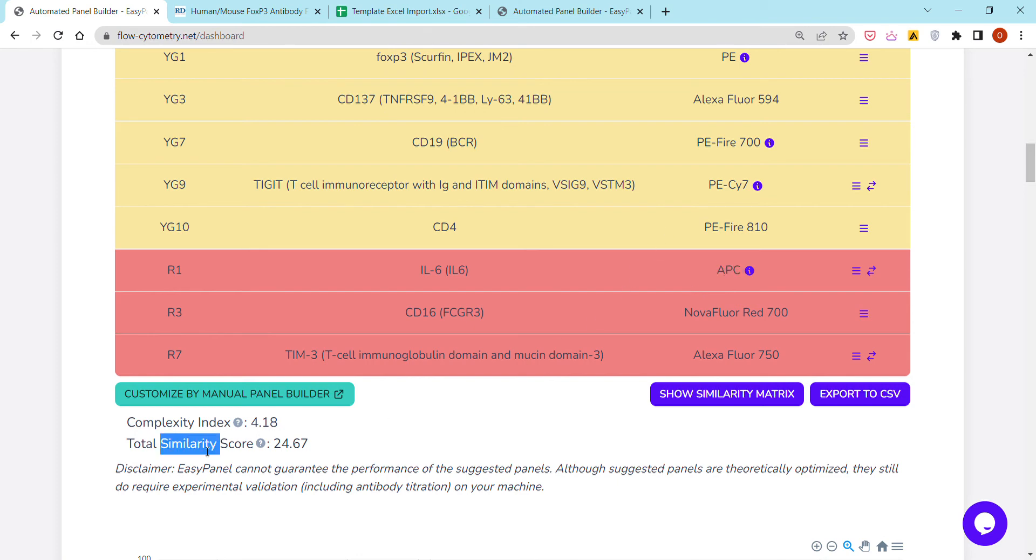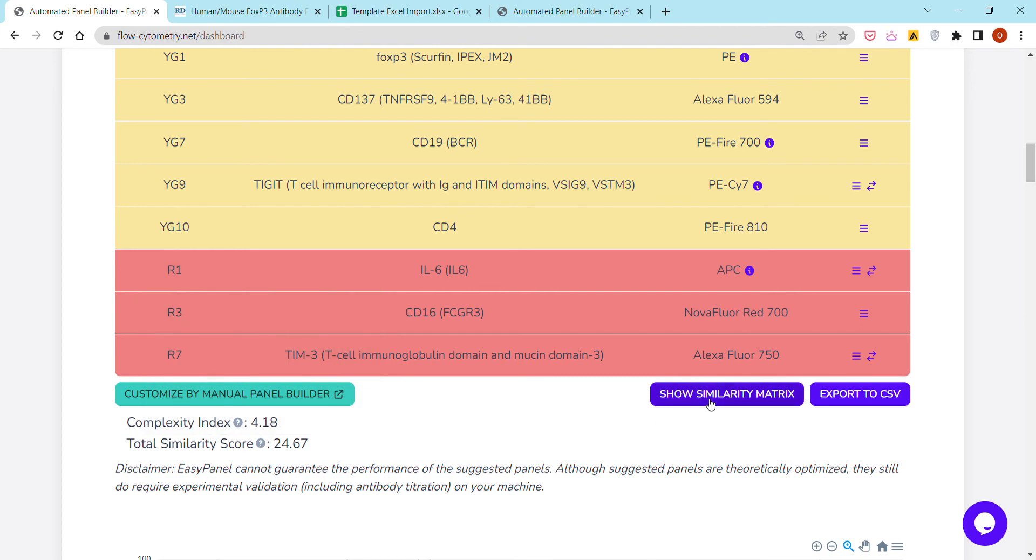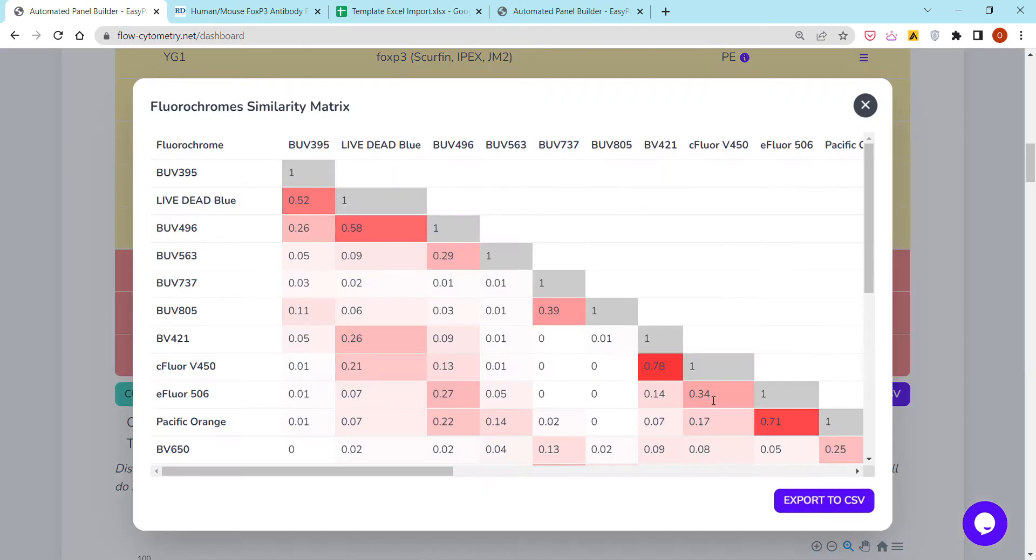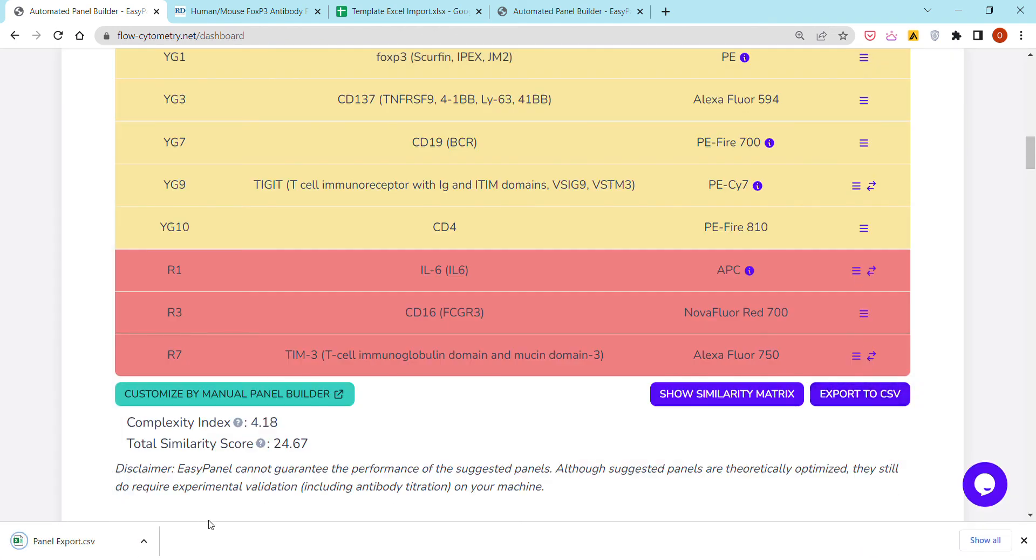We also compute what we call the total similarity score, and by the way it is also explained here. It is essentially just the sum of the similarity scores of the different fluorochromes that you can see here. You can export the panel as a CSV or an Excel to your local computer.